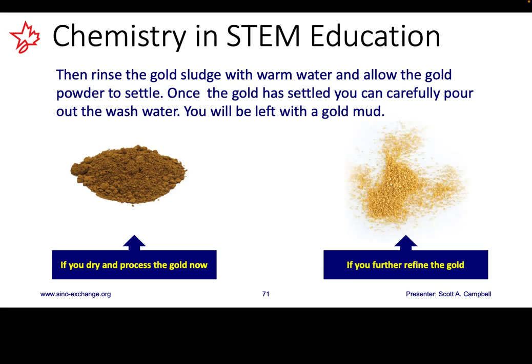To continue filtering out the impurities in the gold, you'll need to add 400 milliliters of hydrochloric acid. Apply medium heat and stirring. As the hydrochloric acid boils, it will react with any remaining metals that are in the powder, and the solution will start getting darker, most likely as a result of iron. Let the solution settle and then perform another stannous chloride test.